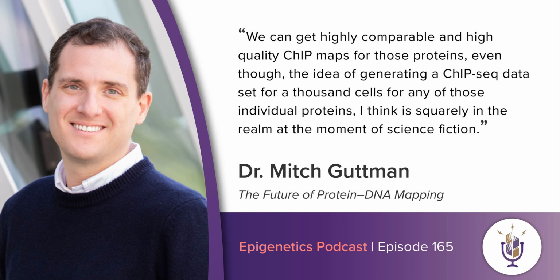what we want to do is actually expand the number of different antibodies we can utilize at the same time. And so instead of using a single antibody bead mix, we conjugate different antibodies to different beads individually. And we barcode these beads using a specific oligonucleotide sequence, a biotinylated single-stranded DNA molecule that has a unique barcode that tells us what the antibody is on that bead.